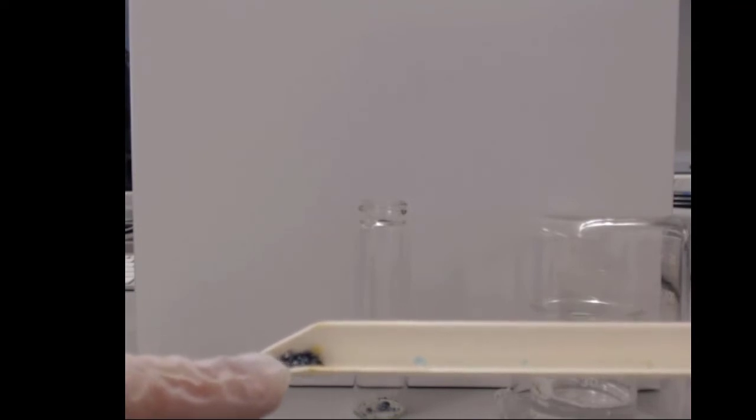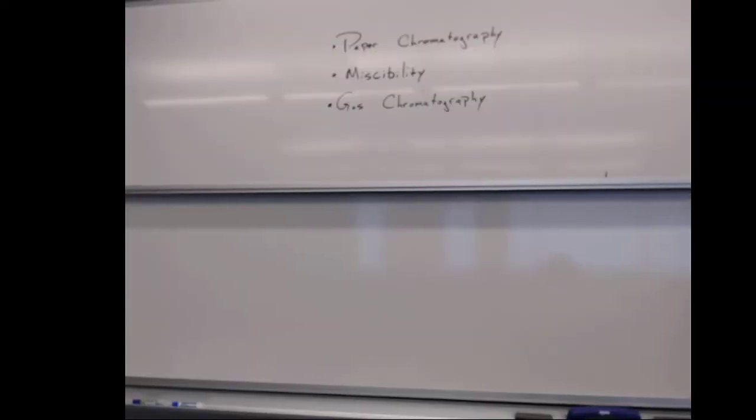For the next IMF demonstration, we're going to consider iodine crystals. Interestingly enough, iodine, I2, makes these kind of strange looking crystals when it forms together. And we're going to look at how this interacts with water versus how this interacts with hexane. But before we look at this experimentally, let's go ahead and think about what this is going to do theoretically.